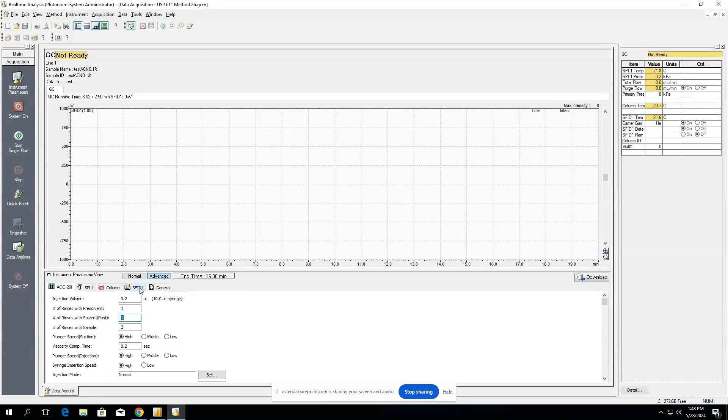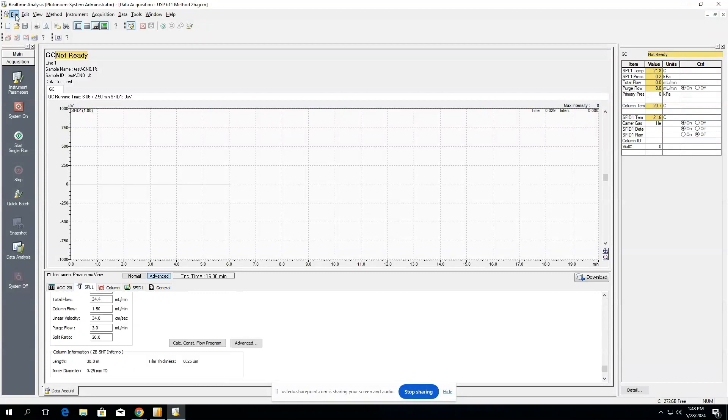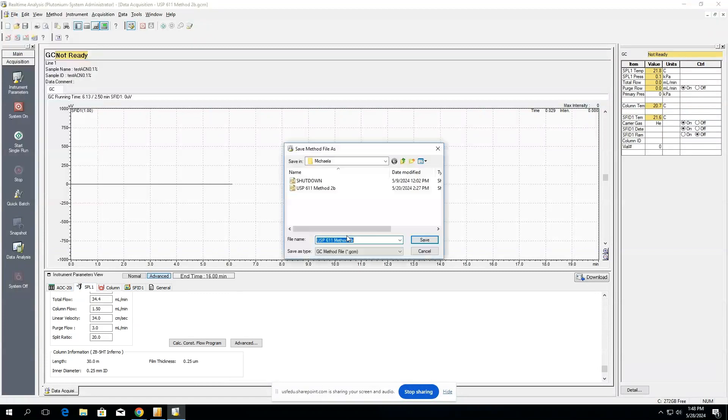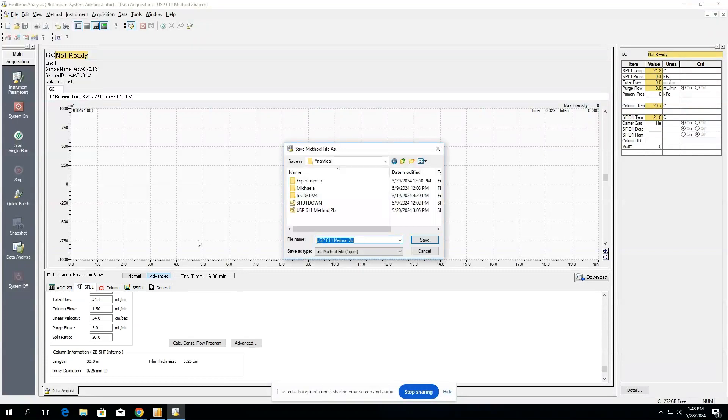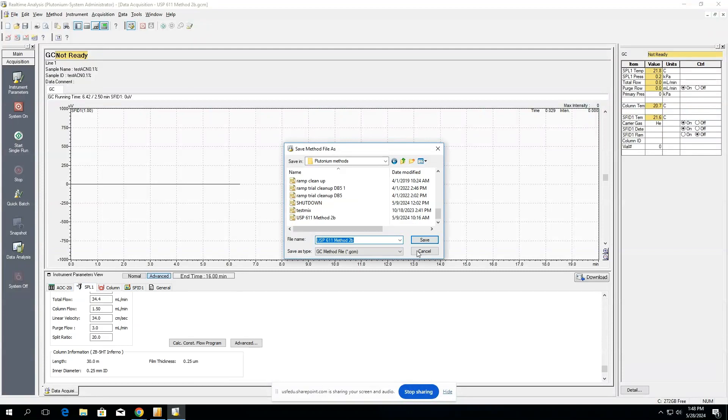Whenever you're done changing all of your parameters, you want to select file, save method file as, and then you might want to select whatever parameters here that are identifiable. So whatever your name of your method is, you can go ahead and change it here and input it, and make sure you save it in a location that you'll know where to find it for the next time.